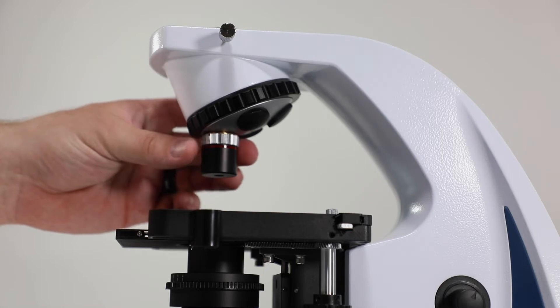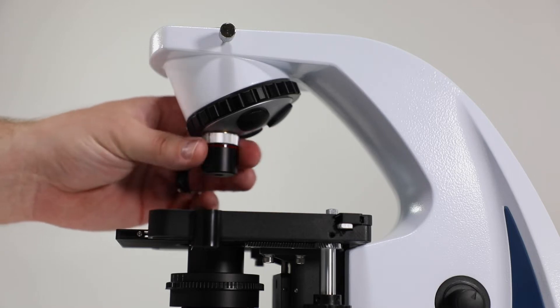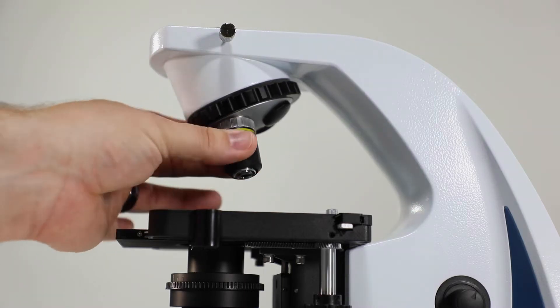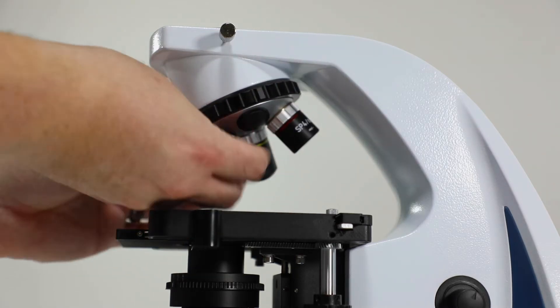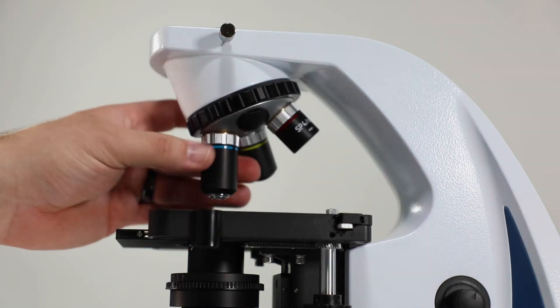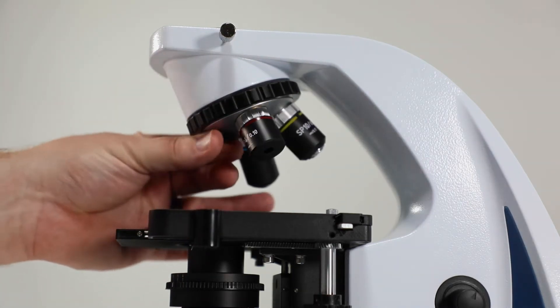Remove one of the protective caps from the nose piece and screw in your 4x objective until it's snug. Repeat the process with the 10x, 40x, and 100x objectives until all four objectives are installed.